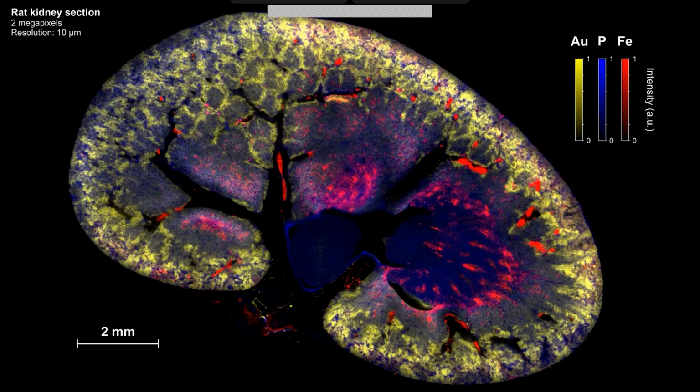What you can see here is that the nanoparticles are really at the periphery of the organ. It's normal for biologists. It's in the cortex region. It means that the particles are being processed by the organ. You can see the phosphorus signal. The phosphorus is really present in the cells, and it indicates the cellular density. So it's cool to get this signal to see where the tissue is. And the iron is related to the blood vessels, basically.